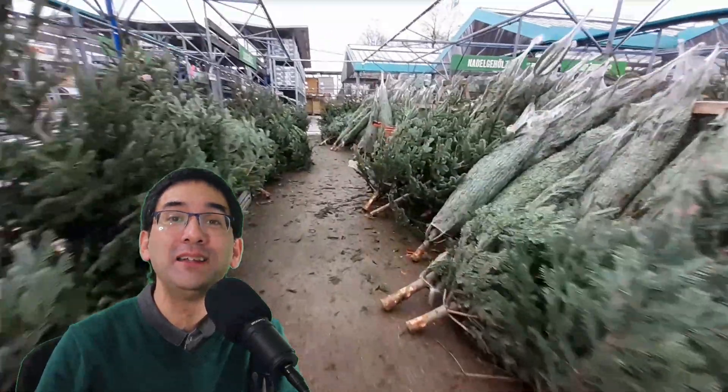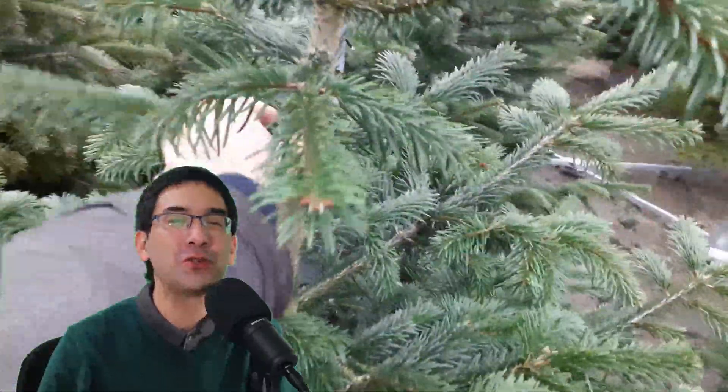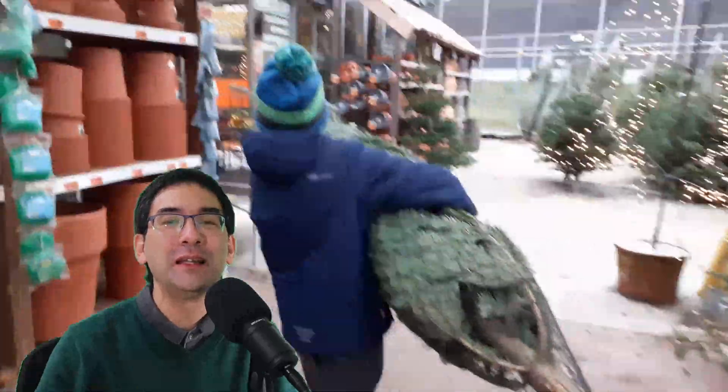This tree was discovered by Alexander von Nordmann back in the 19th century in the Caucasus region. It's a very popular Christmas tree because it doesn't lose its needles when the tree becomes dry. But of course my interests were entirely related to microscopy.